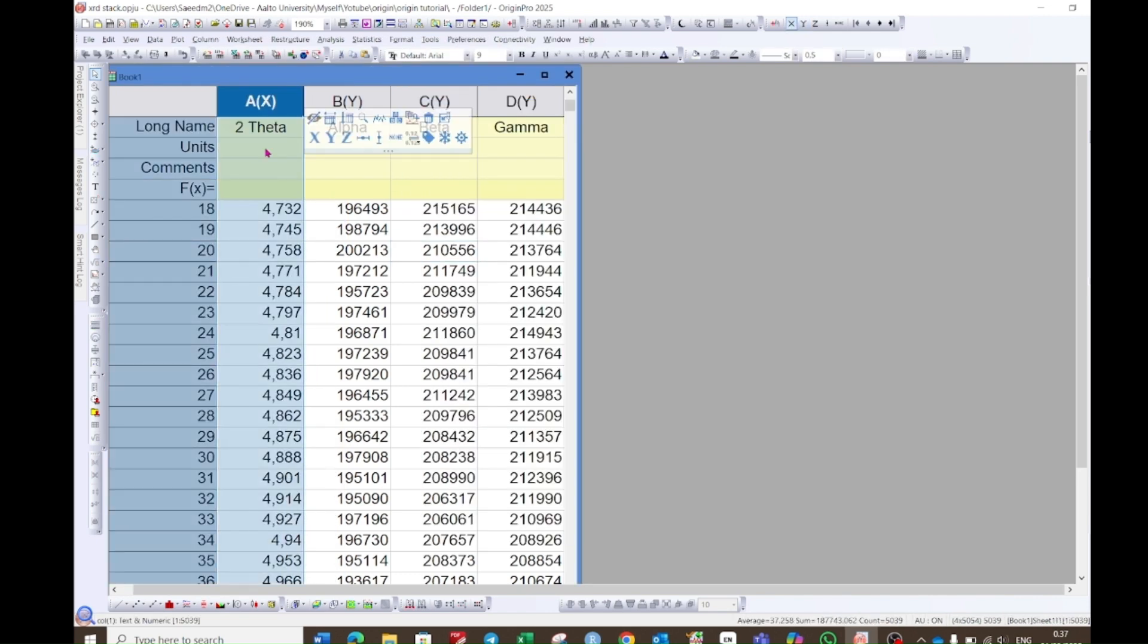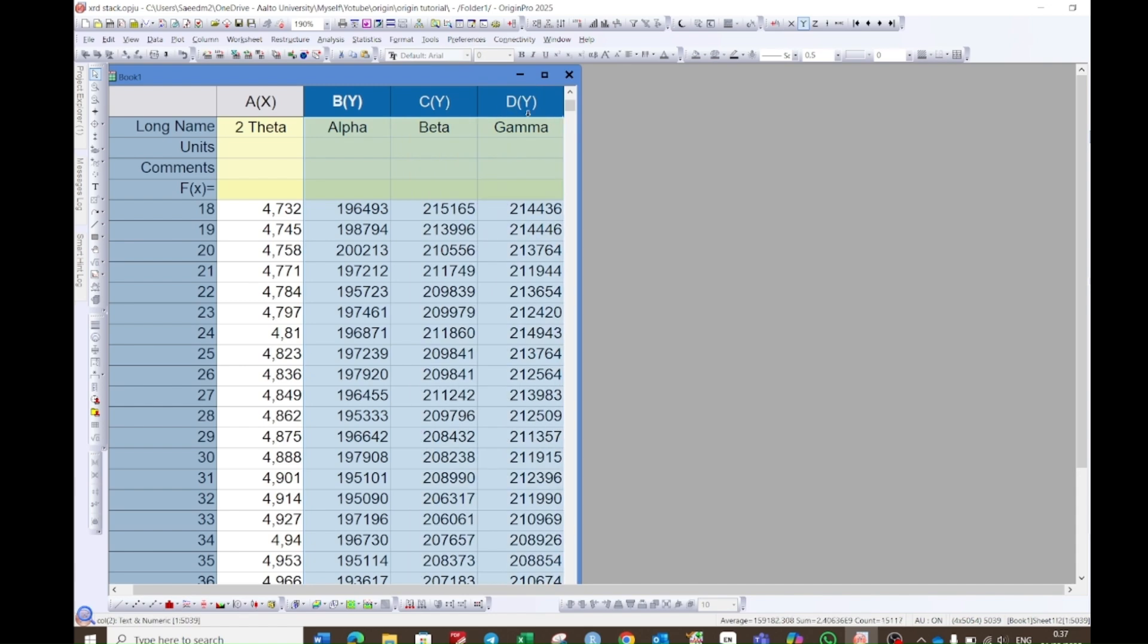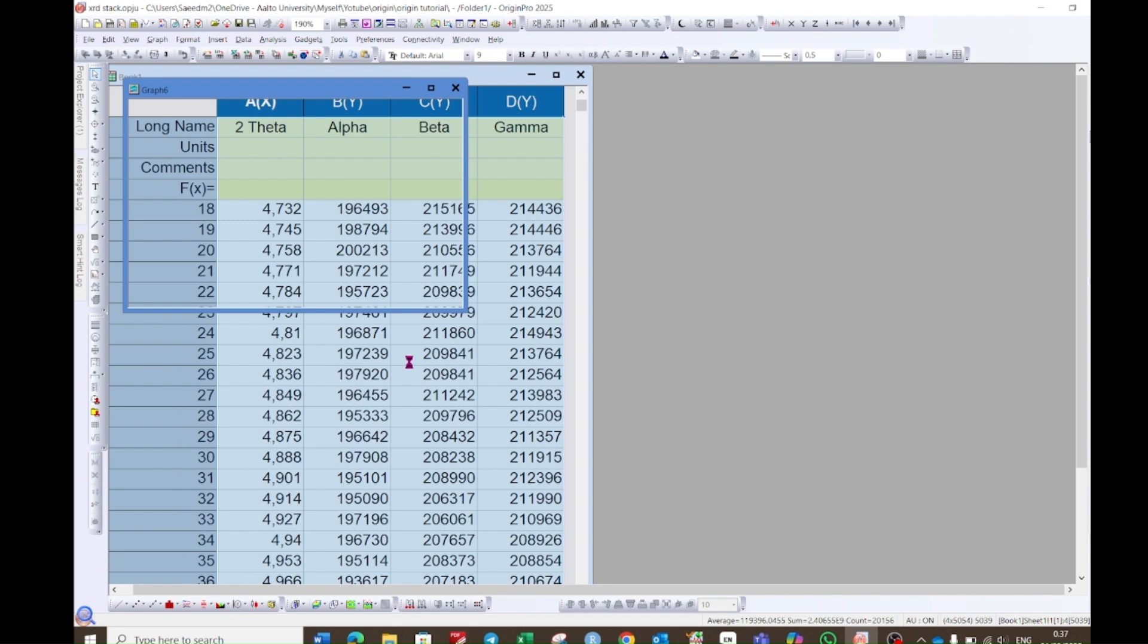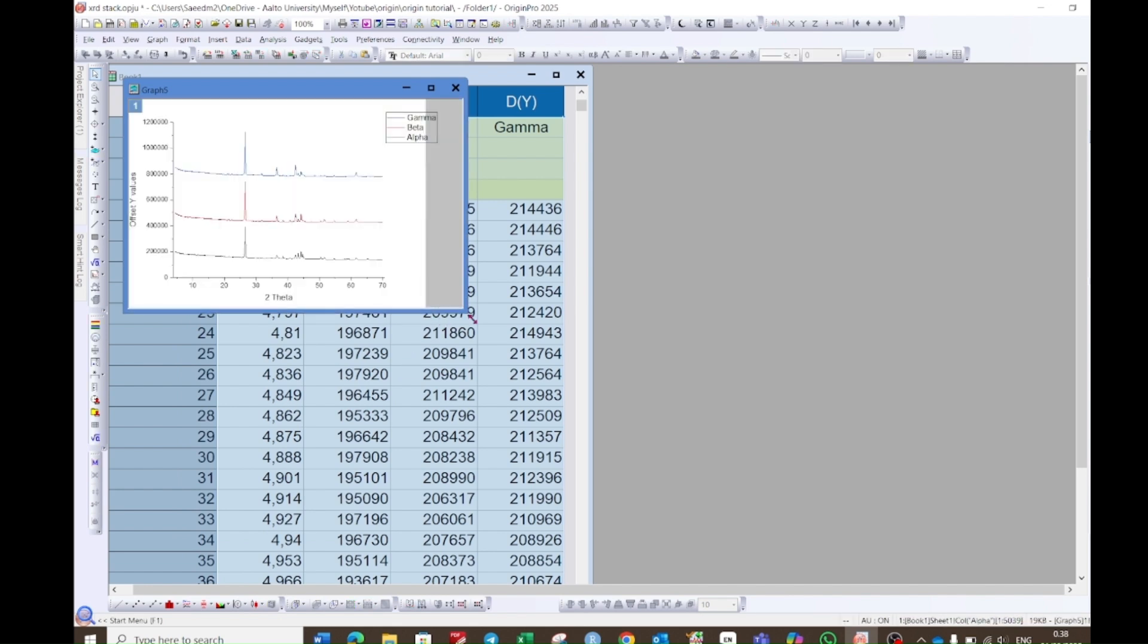Here I have the data for the XRD. The x-axis is the 2 theta and then I have three different samples. Select all of the columns, then go to this option which says stack lines by y offset. Choose this option which is stack lines by y offset. When you click on this, all of the graphs will be stacked by a single y-axis.